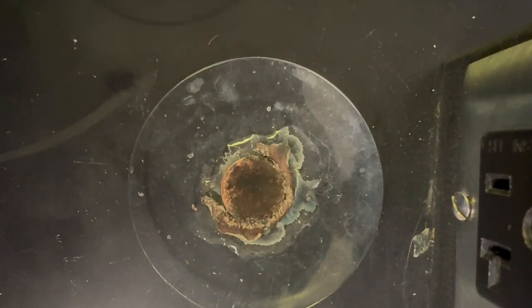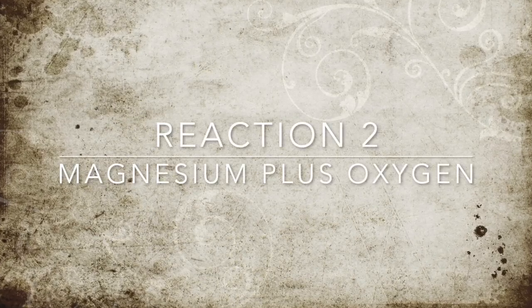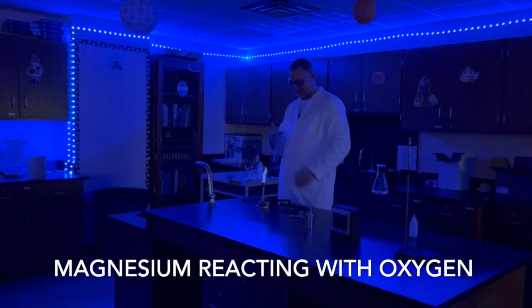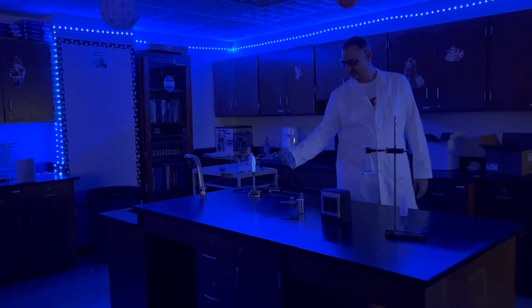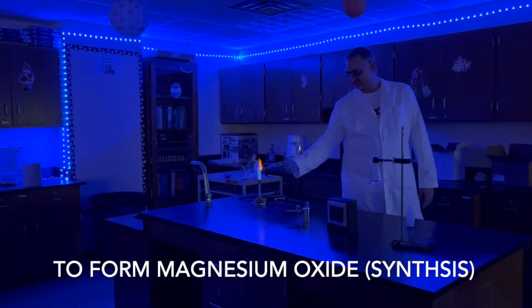So here we can see after the reaction has been going for a while, you can definitely see the chemical reaction. All right, next is magnesium plus oxygen. So this is going to look very much like a combustion reaction, and it is, but we still have magnesium reacting with the oxygen in the air, and that is going to be creating magnesium oxide. So this is a synthesis.